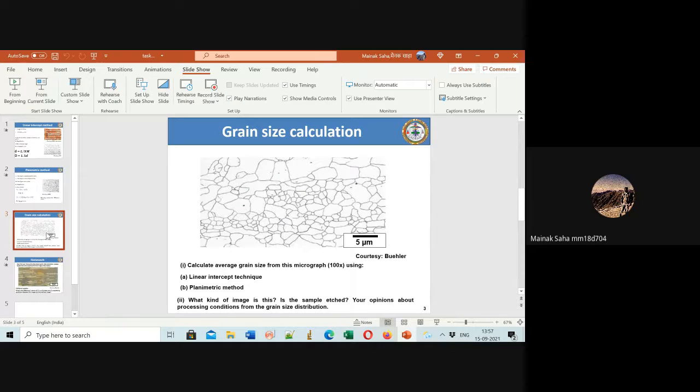Yeah, I understood, but I don't think that is possible in ImageJ. Not possible. It's difficult. I don't think they have given this. It's like a color picker, like there's a color picker option. Yeah.